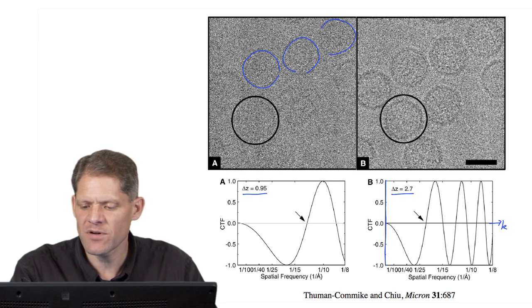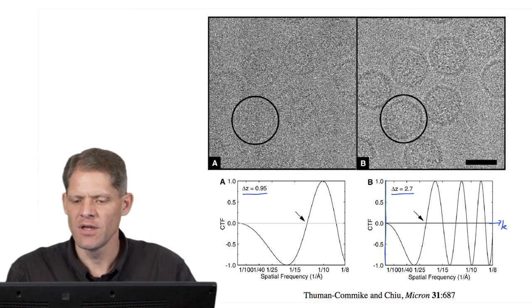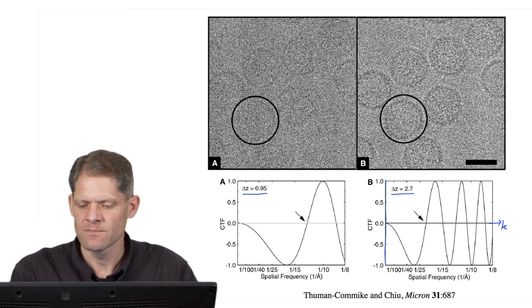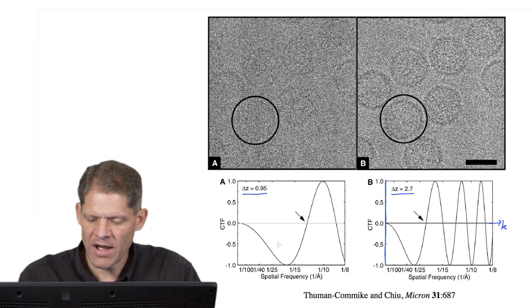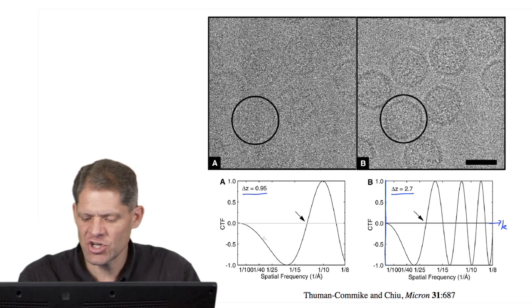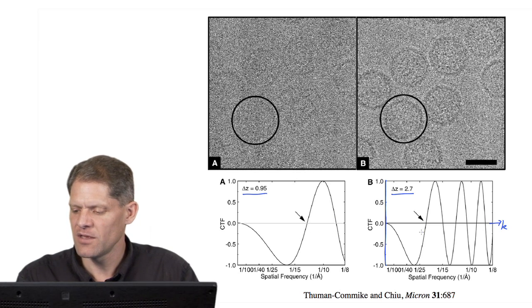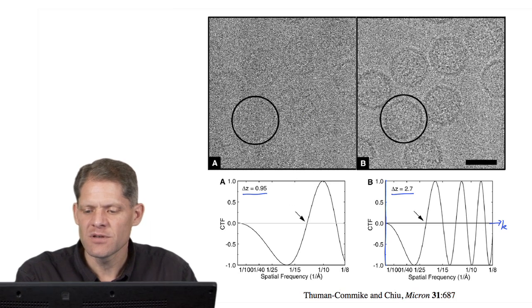They're much more difficult to see, but they're still there. The same pattern of viruses. And if they plot the contrast transfer function for that defocus, you see that it shifted dramatically to higher spatial frequencies, in comparison to this one. And as a result, you see different features in the image.